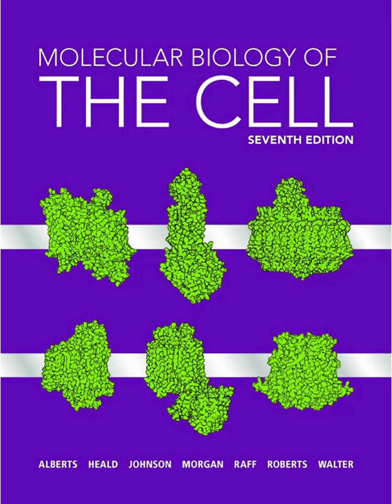What else? There's also photoactivation, using special fluorescent proteins that can be switched on or change color with a pulse of specific light. So you can highlight just a subset of molecules. Yes, you can light up just the proteins in one part of the cell, for instance, and then track where they go over time, separately from any newly made proteins.